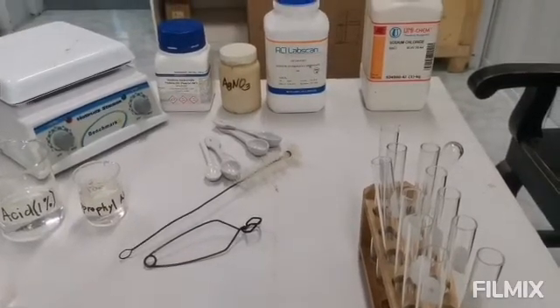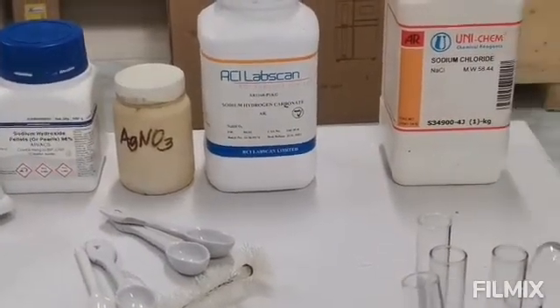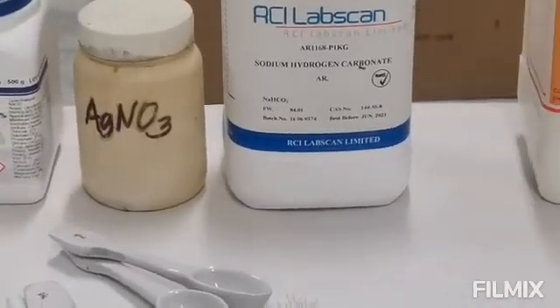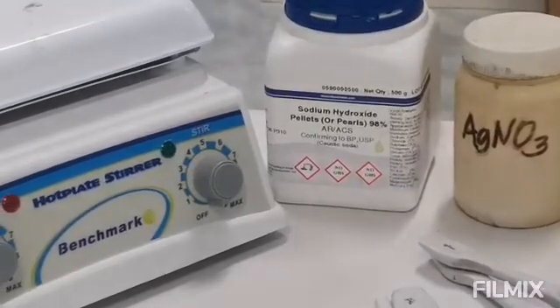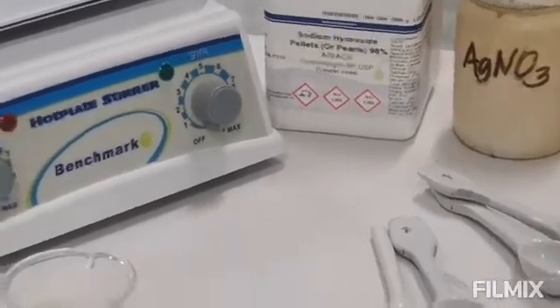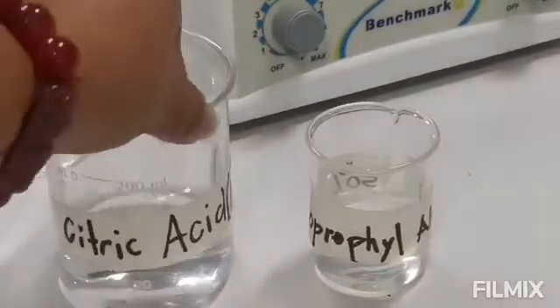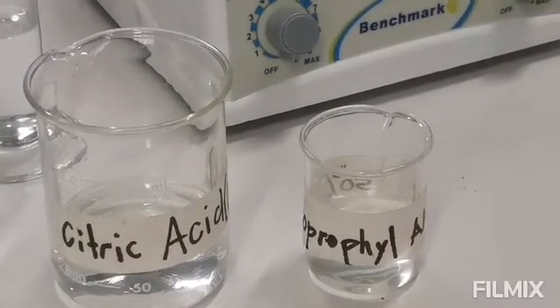So the chemicals that you will be using include your sodium chloride, to be prepared later on as a solution, and you have also there the sodium bicarbonate or sodium hydrogen carbonate, the silver nitrate, and also the sodium hydroxide. There are prepared solutions already, which include your isopropyl alcohol and citric acid. So those will be the testing materials that you will be using.